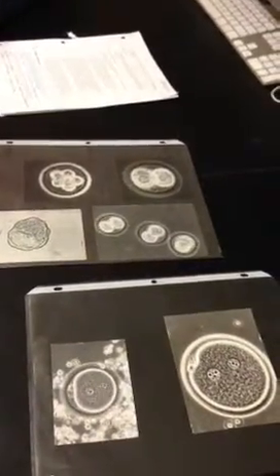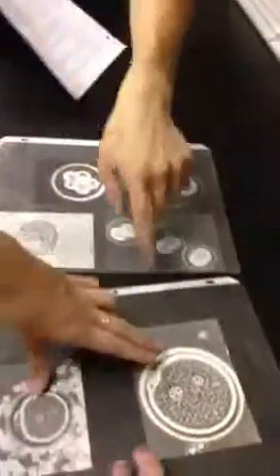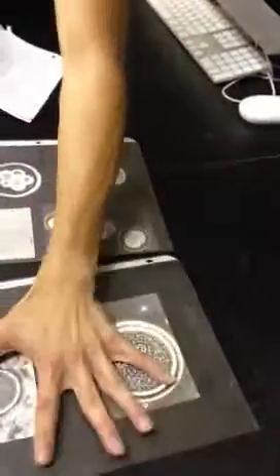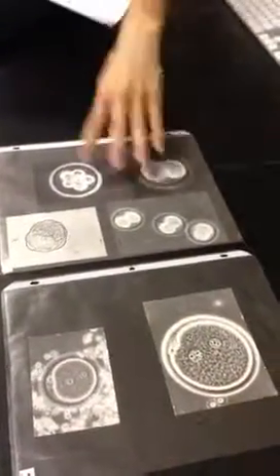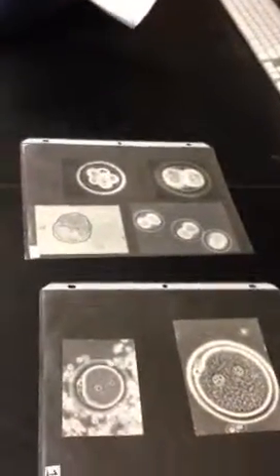What are these again? The white ones, I'm guessing that they're cumulus cells, but I'm not positive, and I won't ask you that. Oh, this one's first. These two are basically the same thing, so this would be like A, one, and then B, C, D. If there was a picture in between, that would be in between, but I don't think there is one, unfortunately. So the order would be A, B, C, D. Well, usually if you do alphabetical order, it is A, B, C. I don't know what letters I'm going to put on them if I put letters on them, but it would be A, B, C, D.